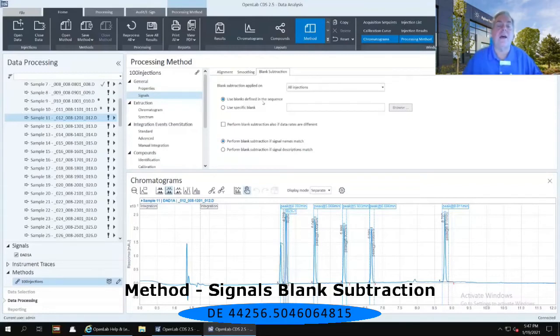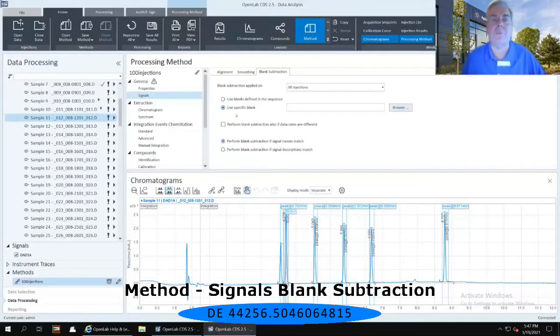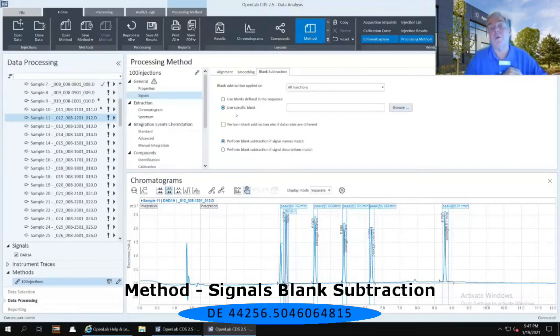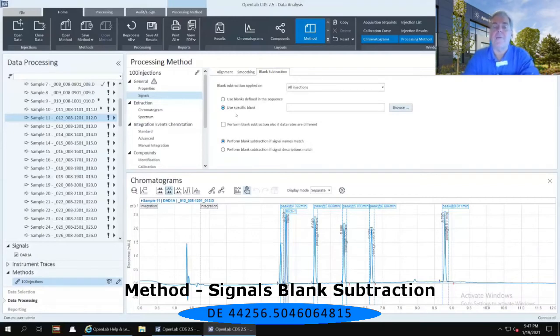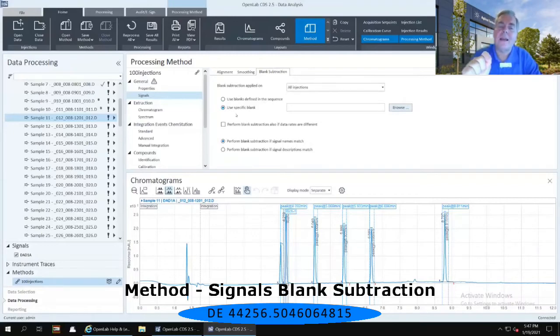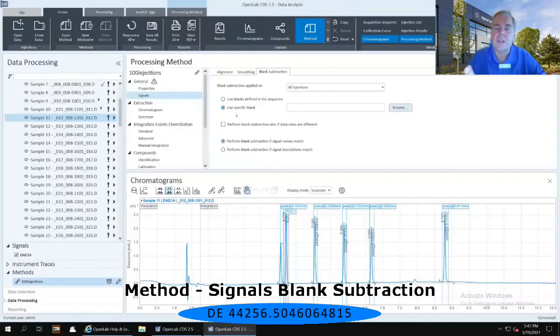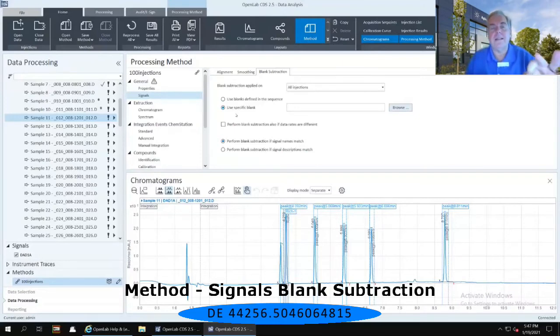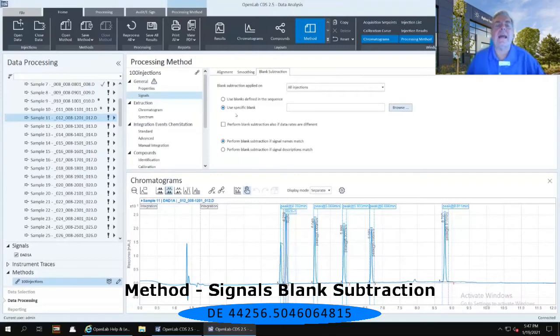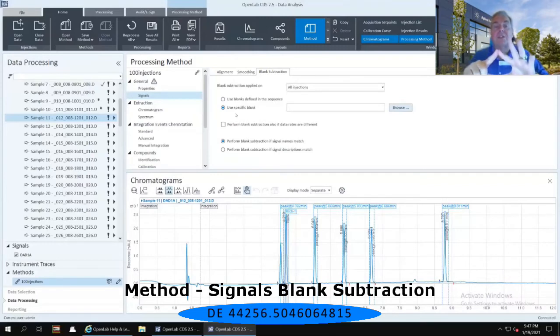Now if you'd rather not have it do it in this type of an order, instead you can select to use a specific blank. So maybe I only have one blank that has been identified in my sequence table. Well, I would like to use that specific blank. Now you'll notice that if you select that radio button immediately to the left of use specific blank, an icon has appeared just to the right of the general, and it is a triangle with an exclamation point in it.